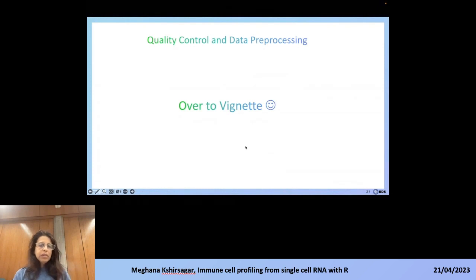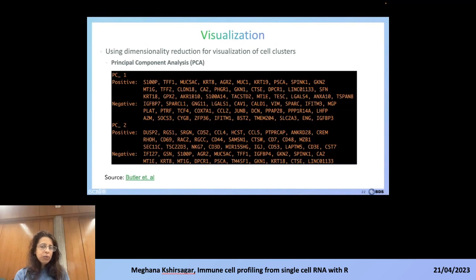Before clustering the cells, the other thing that we need to do is this: though we set the filter range between 400 and 7,000, we still need to make sure that we have captured all the features. The more features we have, the more variance you need in your data set to make sure that your hypothesis is correct.